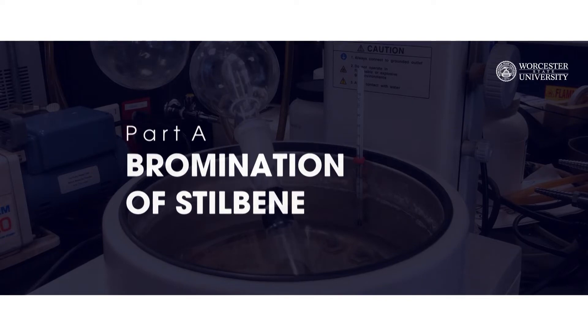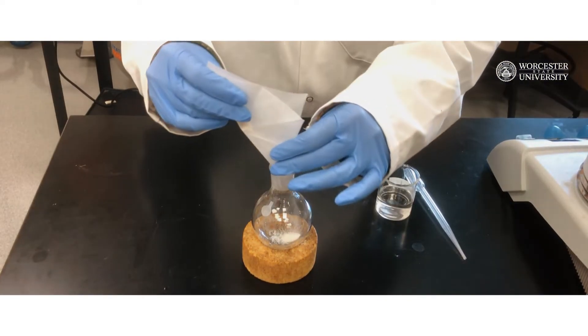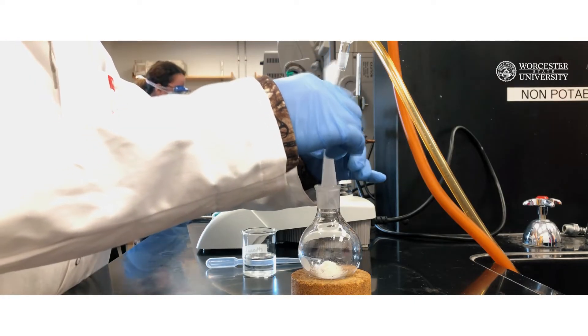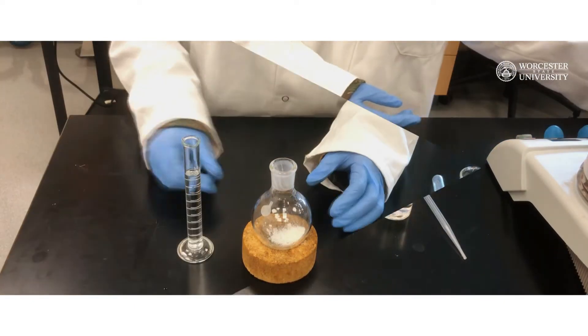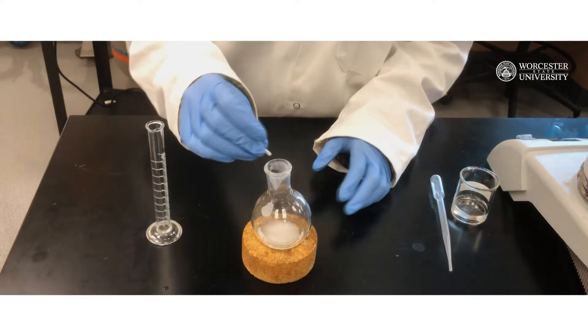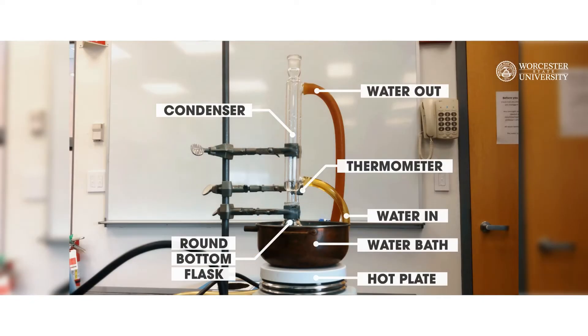Part A: Bromination of Stilbene. Weigh approximately 0.5 grams of trans-stilbene into a 100 milliliter round bottom flask. Record the actual mass of trans-stilbene you use in your lab notebook. Add 10 milliliters of ethanol and a stir bar to the flask. You will then need to set up a reflux apparatus.